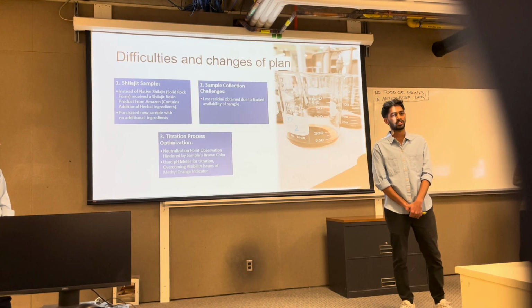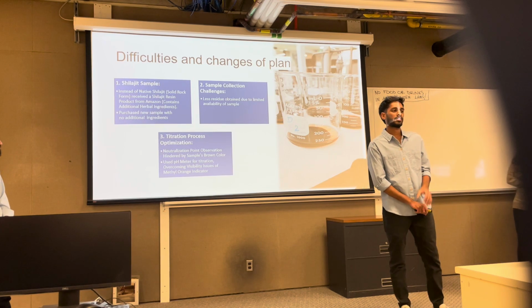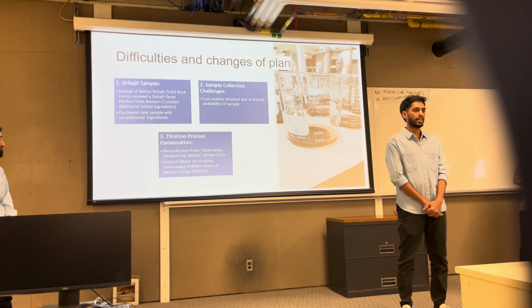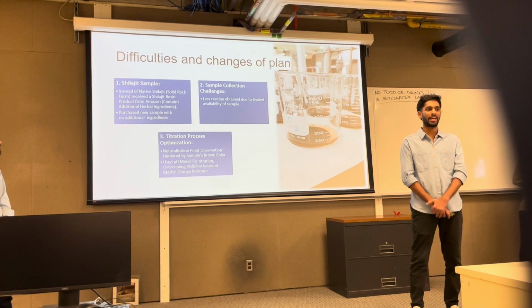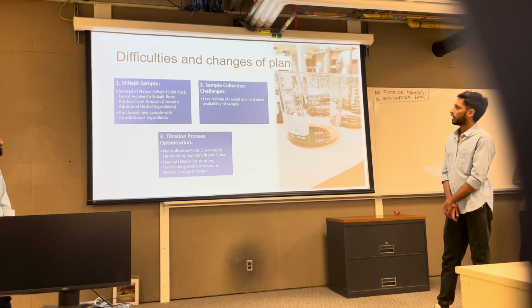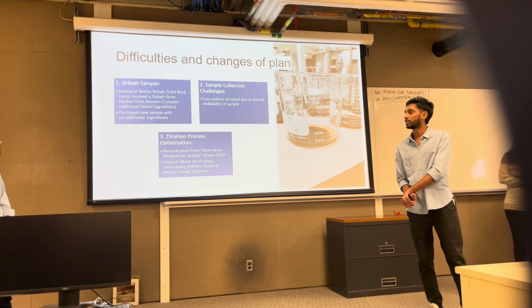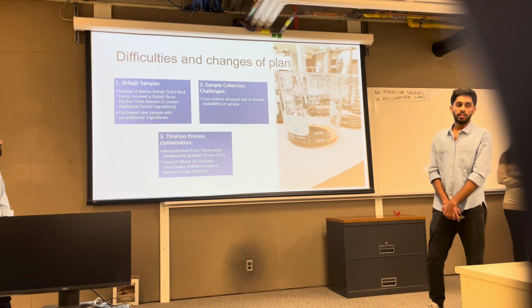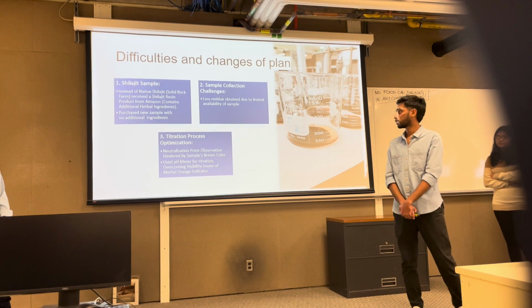Now I'm going to talk about the difficulties that we faced during this project. The sample that we got is from Amazon, which contains less Shilajit content, and it contains an Ayurvedic blend. So we considered it as an impurity. We were supposed to get a rock Shilajit sample, but unfortunately, it's not available online. So we think we didn't get any precipitate due to our sample.